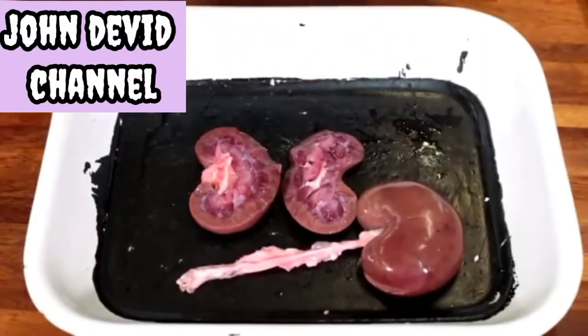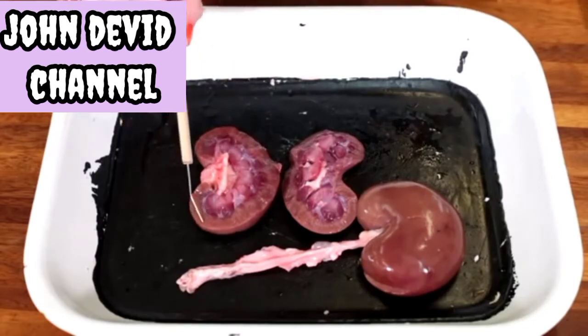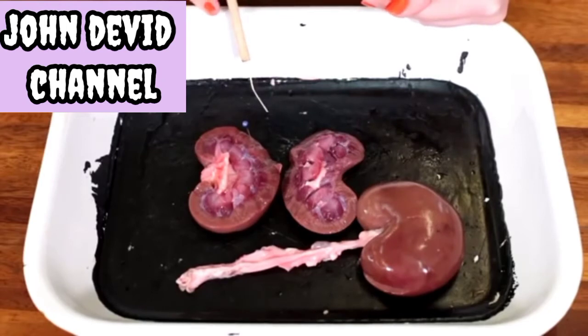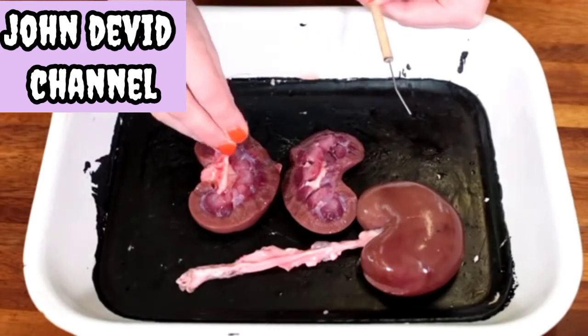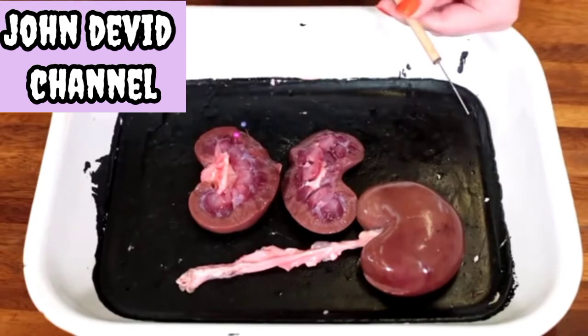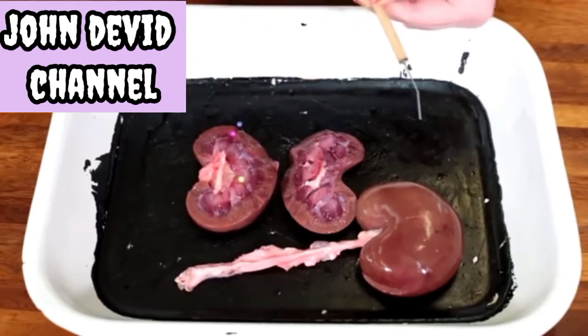When the kidney is opened up, we can use a seeker to probe inside the areas we can identify and discuss the functions they have. This outer layer — the darkish brown colour — we refer to as the cortex, identified by the blue pin. Moving inwards, each segment you can see inside the kidney is referred to as a pyramid, identified by the pink pin. The darker red colour — darker because of a higher density of blood vessels — is the medulla, identified by the yellow pin.